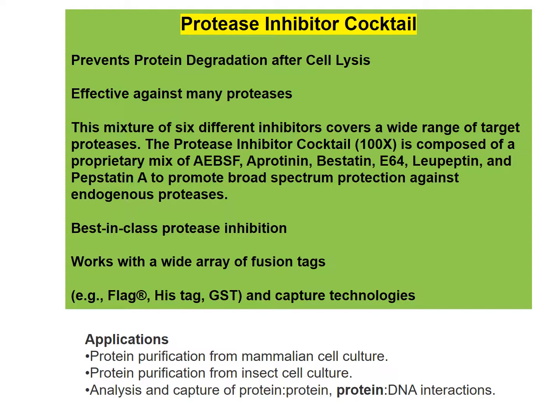When we hit that, you can refer back to here, because when we're trying to purify proteins as well as organelles, we want to inhibit the endogenous proteases that are available. The cocktail can be used in mammalian cells, insect cells, plant, yeast, and is also very useful when you're trying to purify one protein that's handshaking with another.